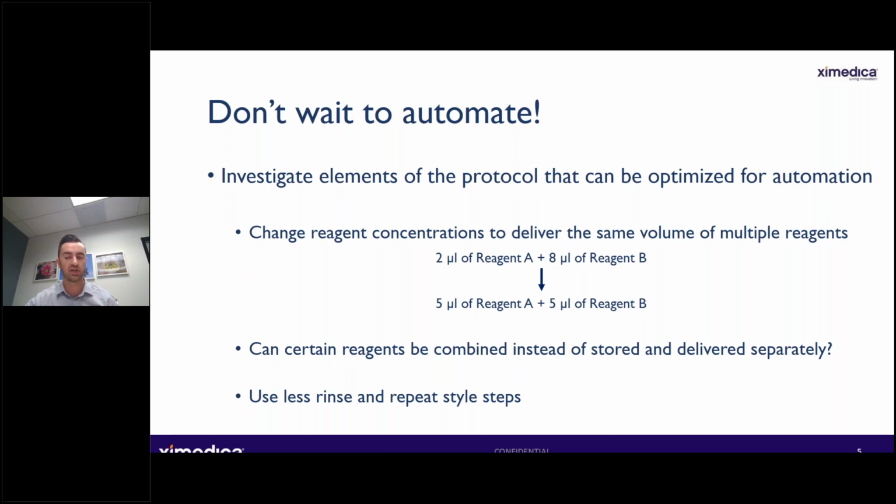So it might not necessarily be significant, but depending on how you're automating your protocol, if you're using a microfluidic cartridge, for example, it could be useful for you and your instrument development team to know where some of the protocol can be flexed and changed, where we can push back on some of the things we think are hard constraints.